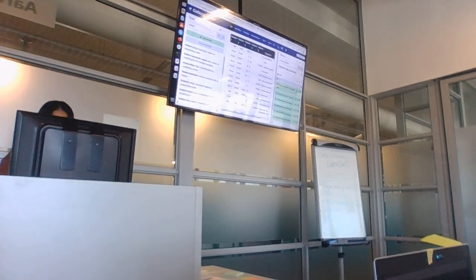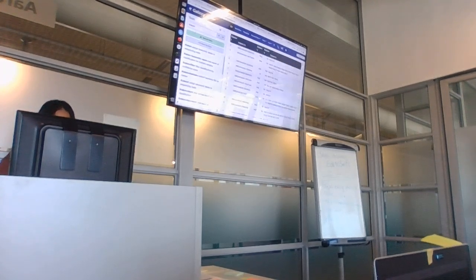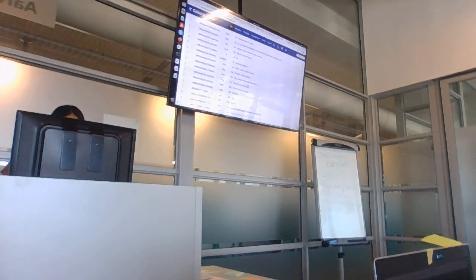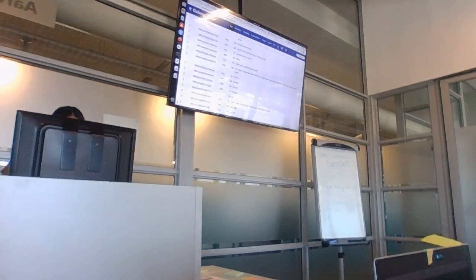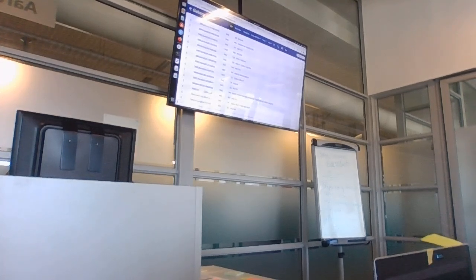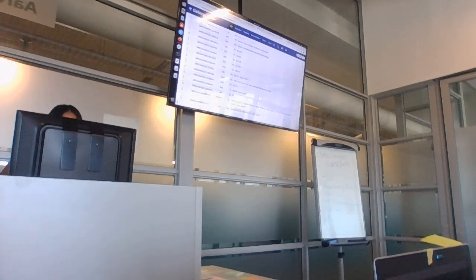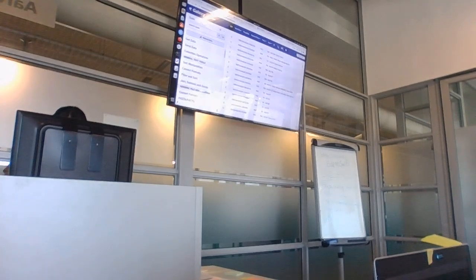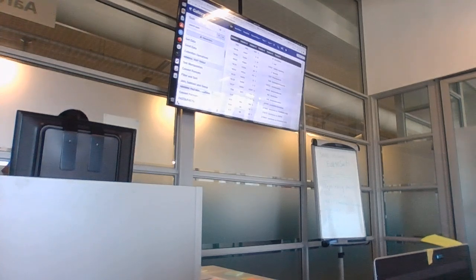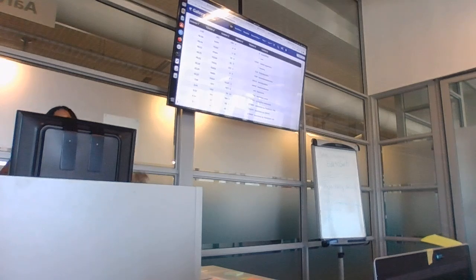Because I kind of, yeah, I prefer. But what you can see here is that it. Where's my stuff? No, maybe I am on the wrong one. Yeah, this is the one.